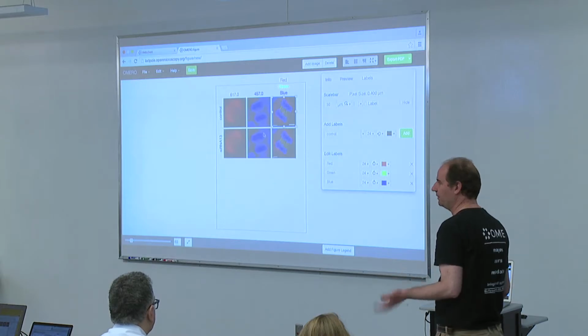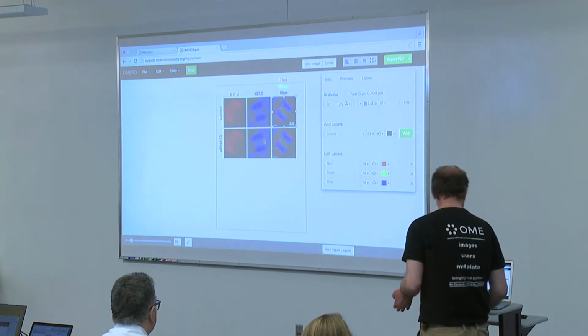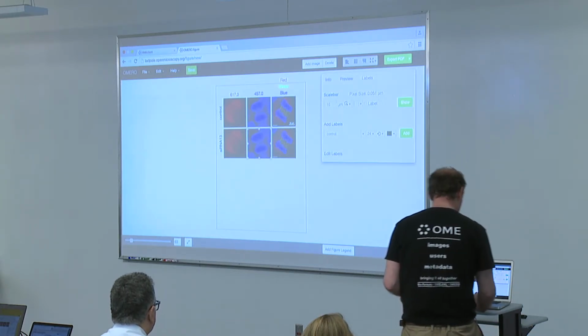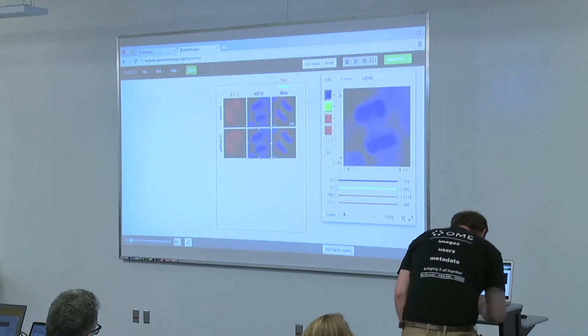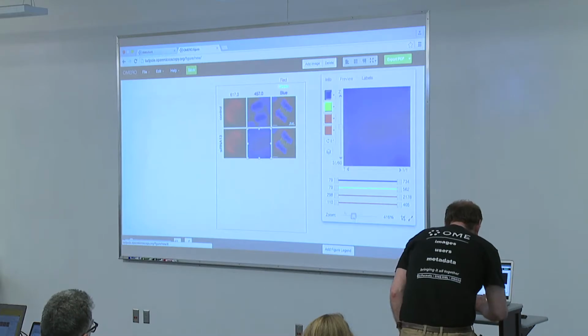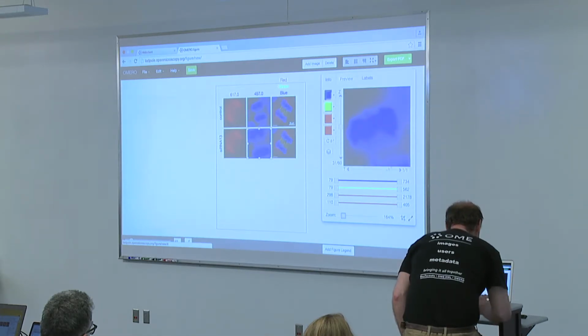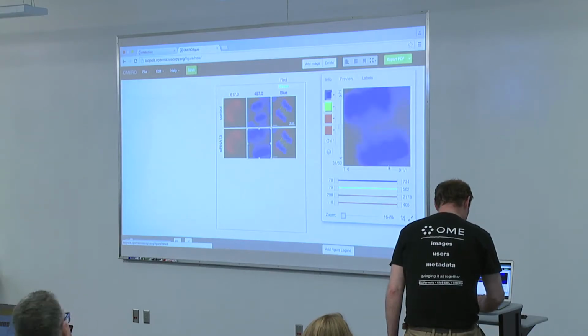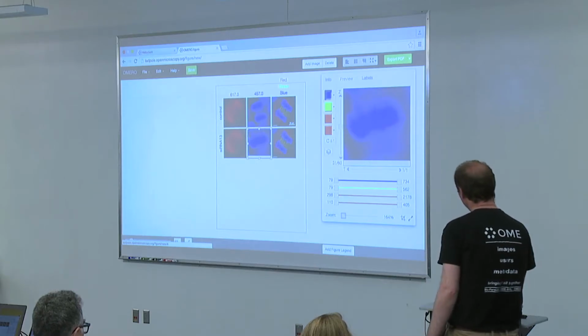Of course, you can put the scale bar wherever you like, and also put the label on it, which says how much it is. You can zoom in or out of the image. Well, that's not very interesting. But as I was doing it, I was actually going, let's say, to here, onto this feature.